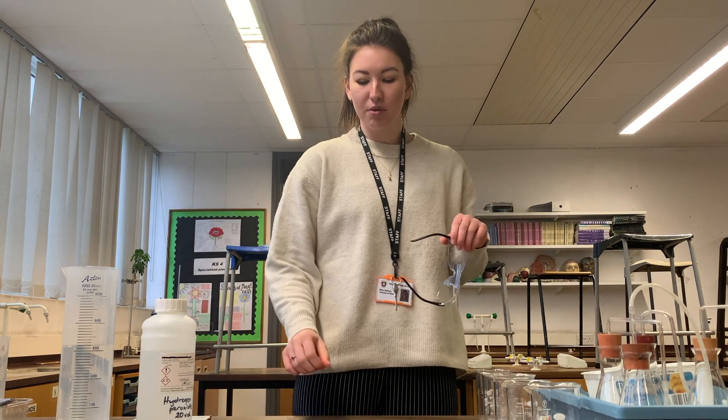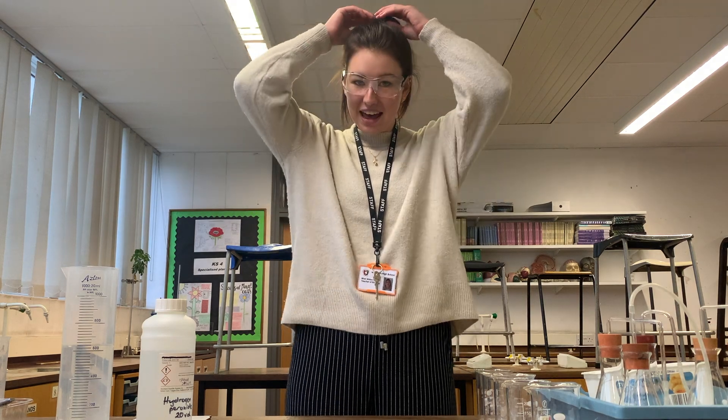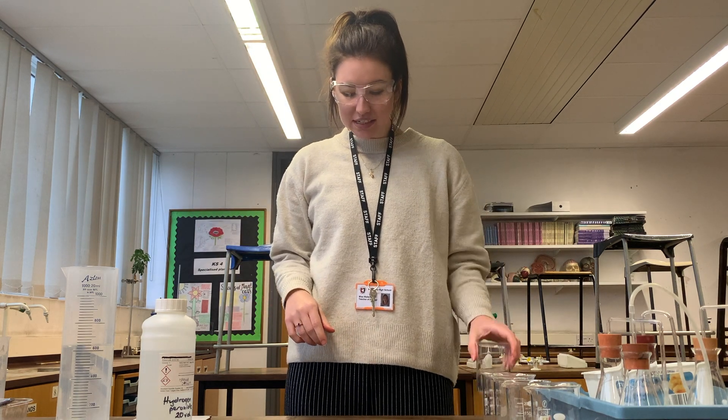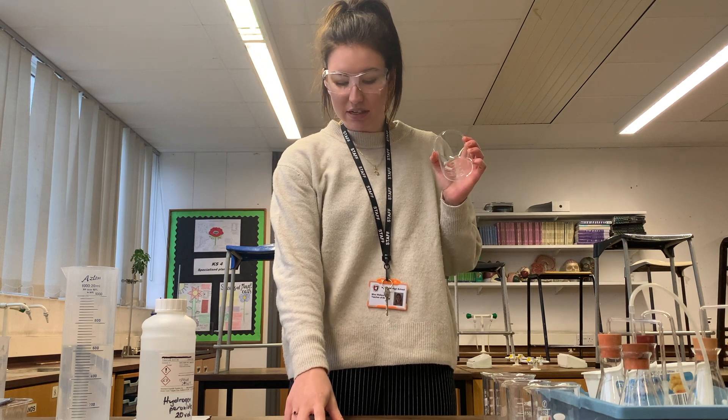Because hydrogen peroxide causes eye irritation, I've got my safety goggles and my hair is up. I have all of the equipment around me, and the first thing we have to do is label the 250 centimetre cubed beakers.